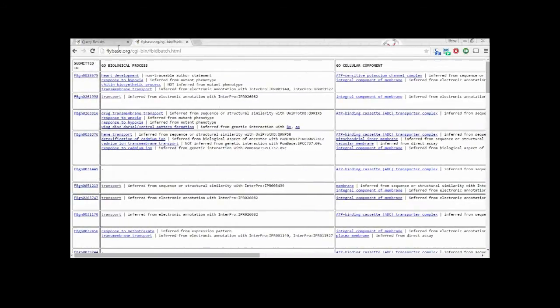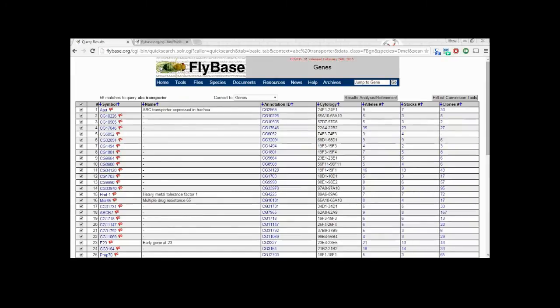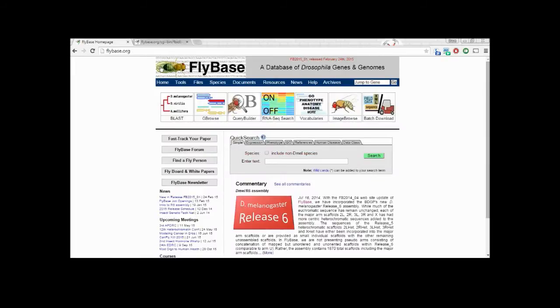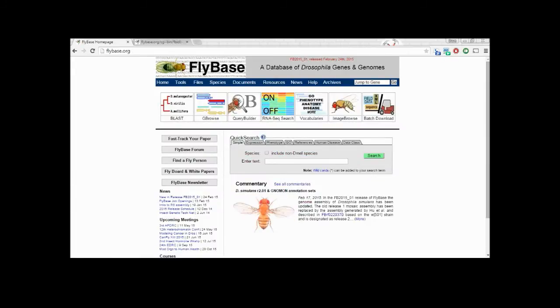These two methods of data visualization are only a small subset of the features that FlyBase is capable of, but are valuable in your understanding of a novel Gal4 UAS cross.